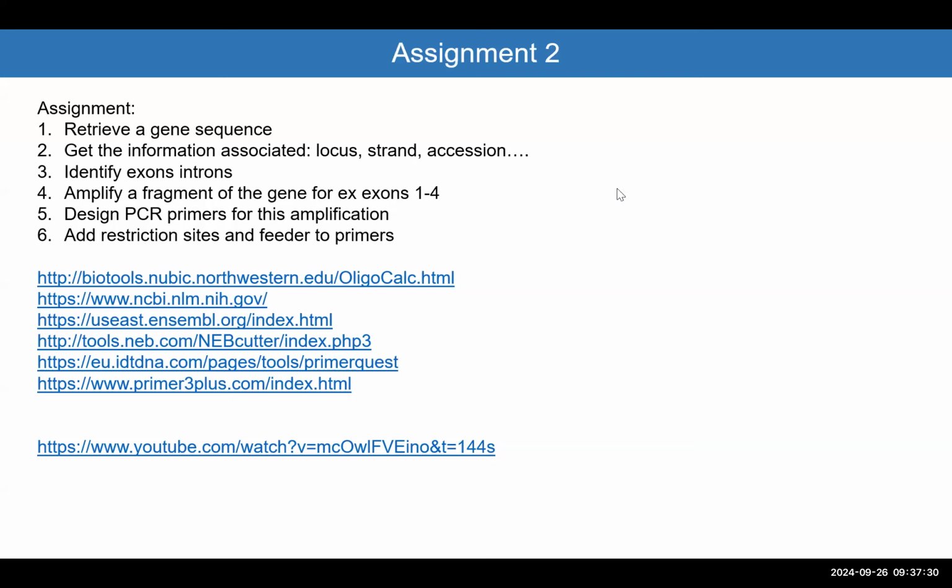Any more questions? I still want to go a little bit on the NCBI since we have a few minutes left. Okay. So let me go back to the NCBI website then.